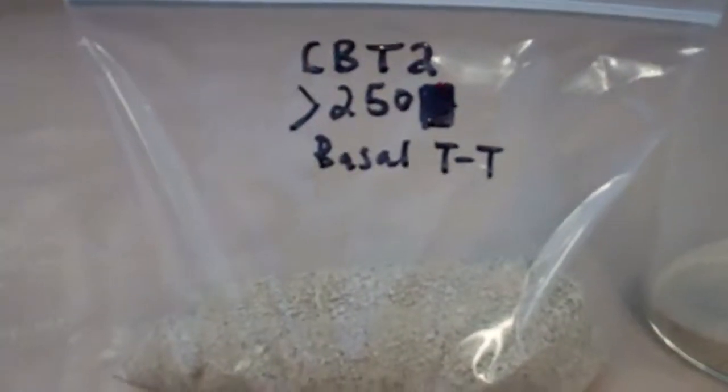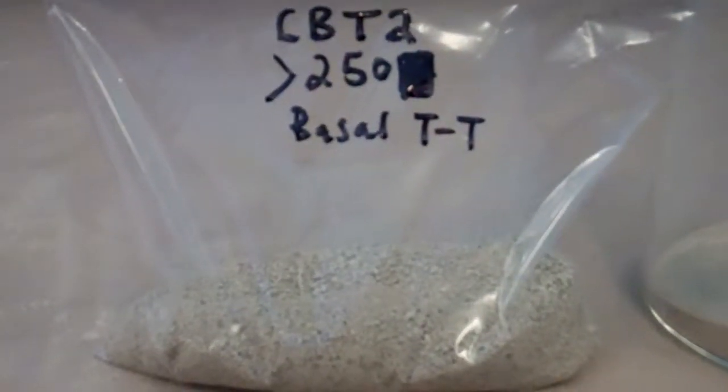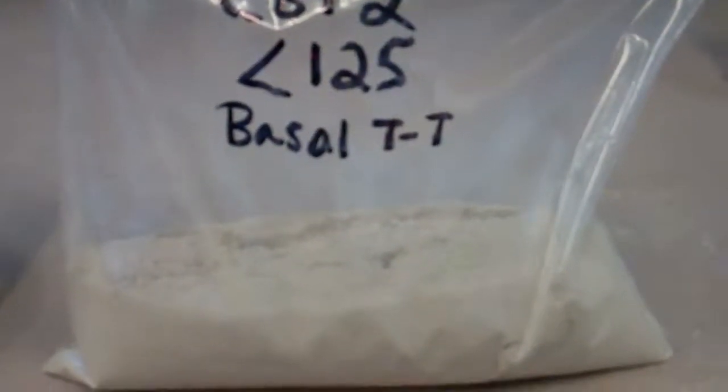So after crushing all of those rocks and putting them through the dry sieving, this is what we have. We've got stuff that's too big — greater than 250 micrometers. We've got stuff that's too small — smaller than 125 micrometers. And then we've got what's in the middle, which is just right: 125 to 250 micrometers, and that's what we want. From a bunch of rocks, you really only get what you're looking for, which won't be very much, so we have to be very careful. Now I'm going to take this fraction and water sieve it.